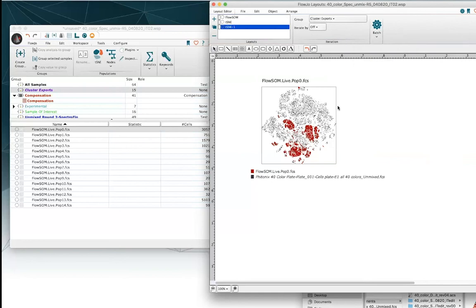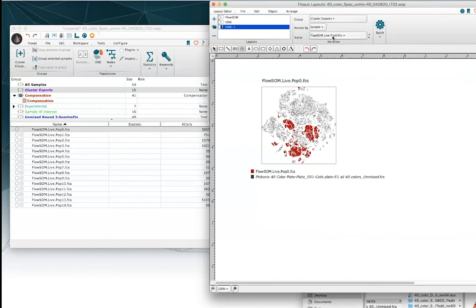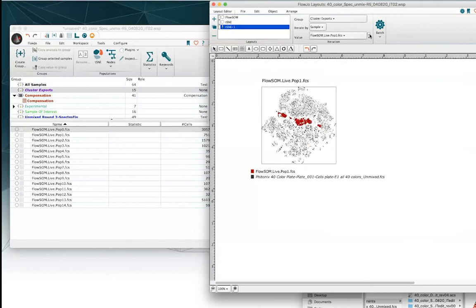Maybe I want to preview what that's going to look like for the next sample. You can change your iteration — it has a wide variety of options, but the one we want to use now is sample. You can also batch by panel or by keyword if you want to get more advanced. The value for that first sample is listing just my FlowSOM population, because that's the population that's not held as a control. If I switch to the next sample, it'll show me the next sample, and so on — because we exported our FlowSOM clusters, each sample is a cluster. Looking beautiful.